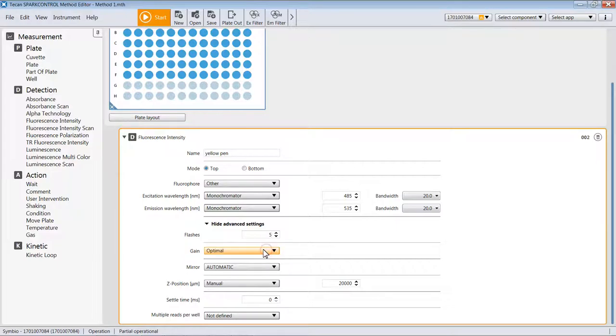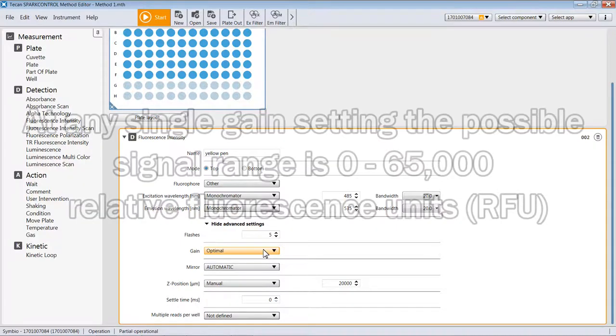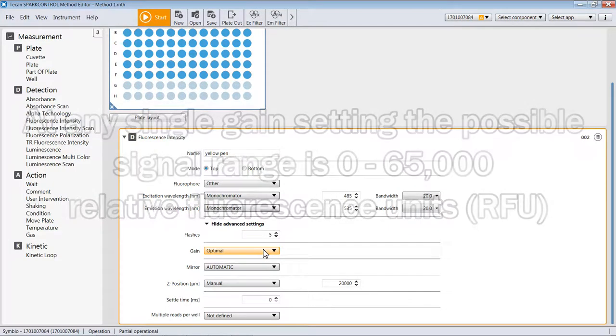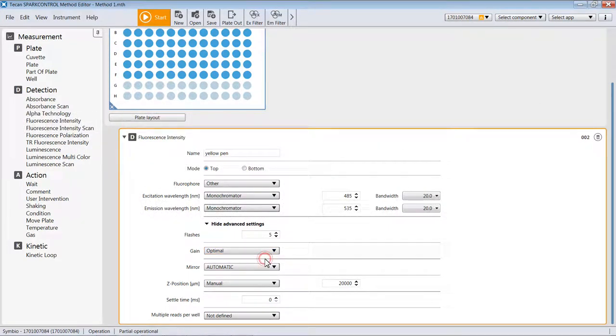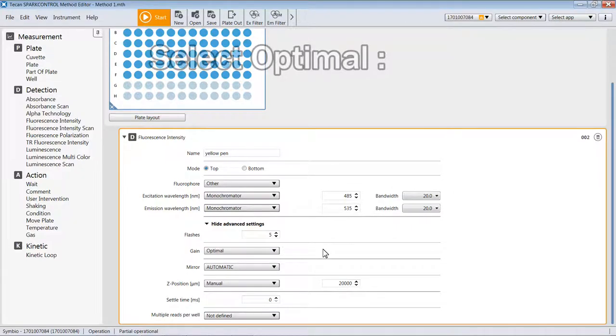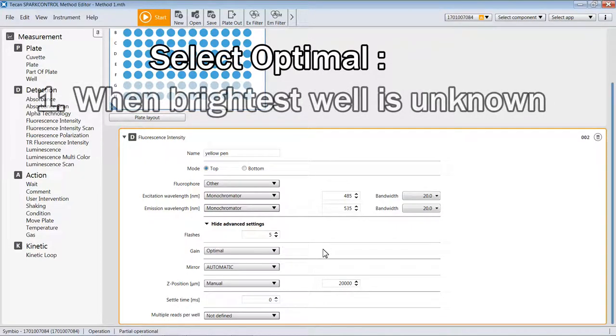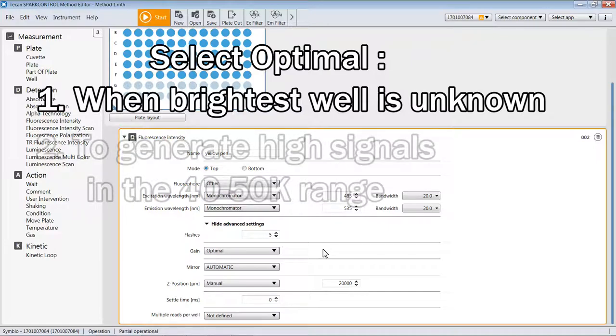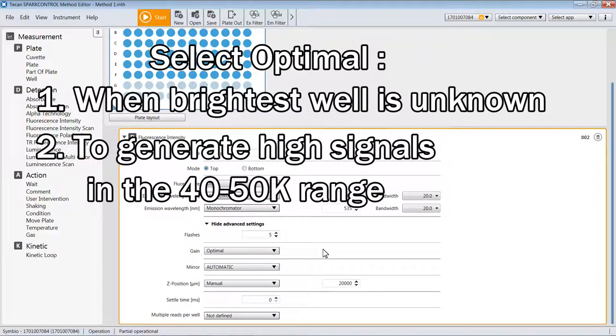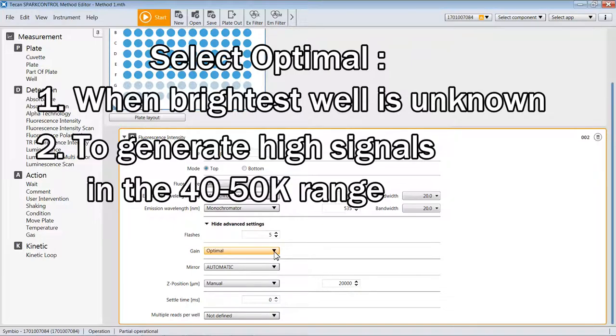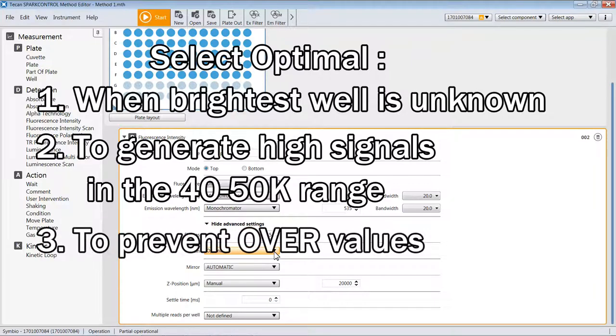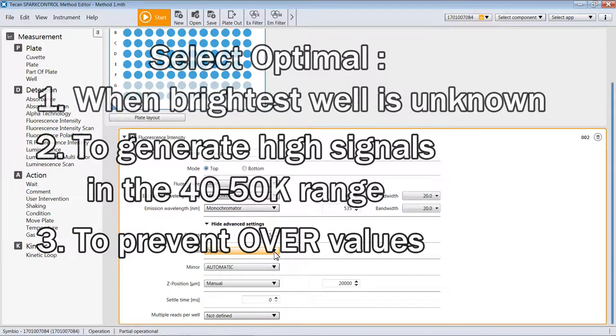For the gain setting, this is how the instrument adjusts the voltage on the detector to affect how much signal is presented in the data output. The signal range is 0 to 65,000 relative fluorescent units. When you select optimal, this is where you do not know where the brightest sample is on the plate, and you'd like the reader to go and find that sample and adjust the voltage so that that sample's RFU value is effectively 45,000 to 50,000 counts. Once it finds the correct gain to generate that value, it will read the entire plate at the gain it finds. This way, you do not run the risk of any well on the plate having an overvalue, where it goes beyond the range of 65,000.